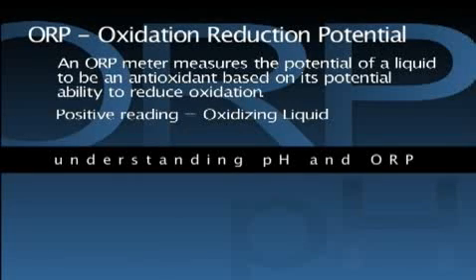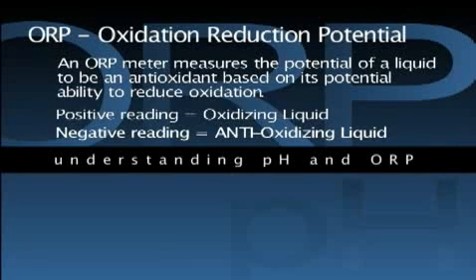A liquid with a positive reading from an ORP meter is an oxidizing liquid, and the higher the positive number, the stronger the oxidizing potential of the liquid. Contrary, a liquid with a negative reading is an anti-oxidizing liquid, and the lower the negative reading, the stronger the liquid is as an antioxidant.